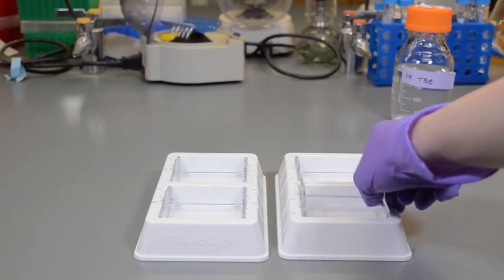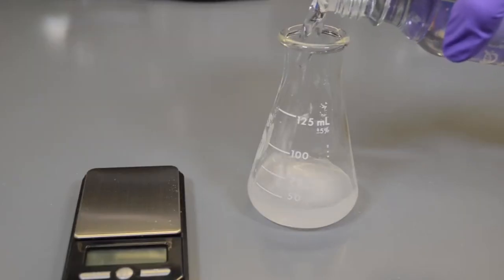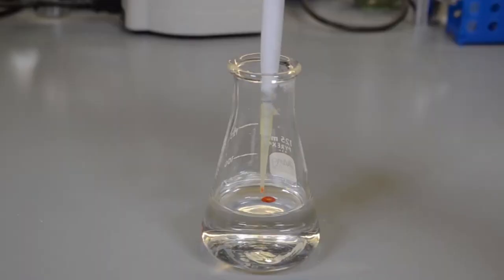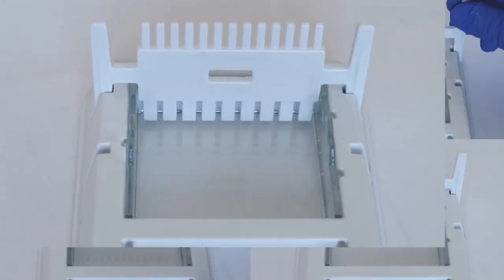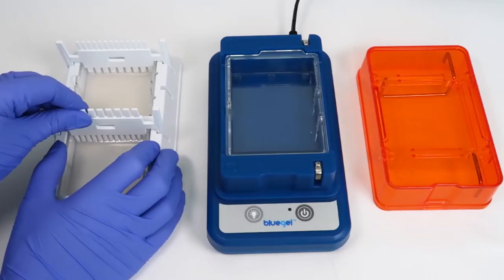The trays fit directly into the casting platform, helping to keep gel pouring mess-free. The process is as simple as melting agarose, adding dye, and pouring the gel. The two-sided combs give you the ability to create gels with 9, 13, 18, or 26 lanes, and the small gels will set in just 10 minutes.